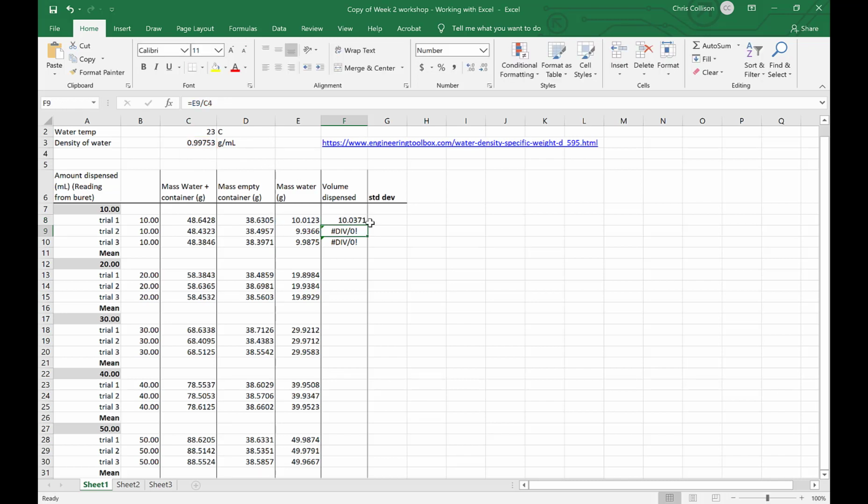And what that does, I'm going to now demonstrate again by dragging that equation down. If I click in cell F10, we find that E10 is in the numerator. That's exactly what we want. But the denominator is locked as being the third row in column C. So we've locked row number 3, and that means that we retain this value.